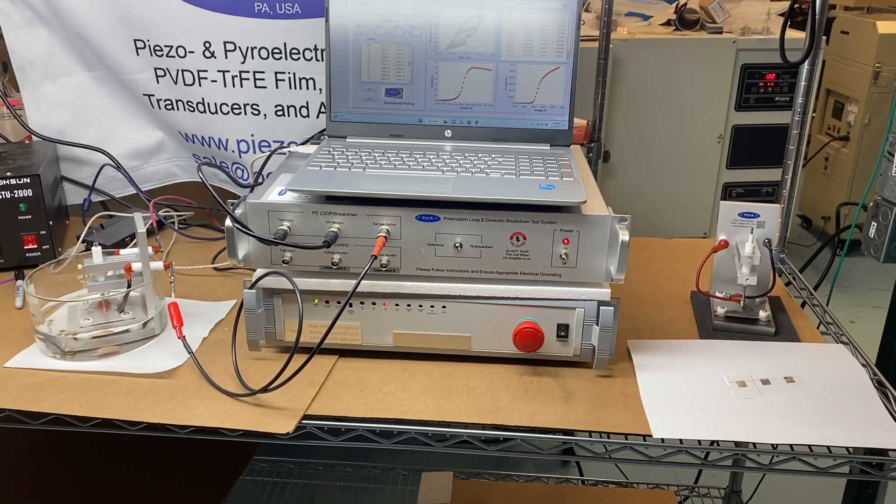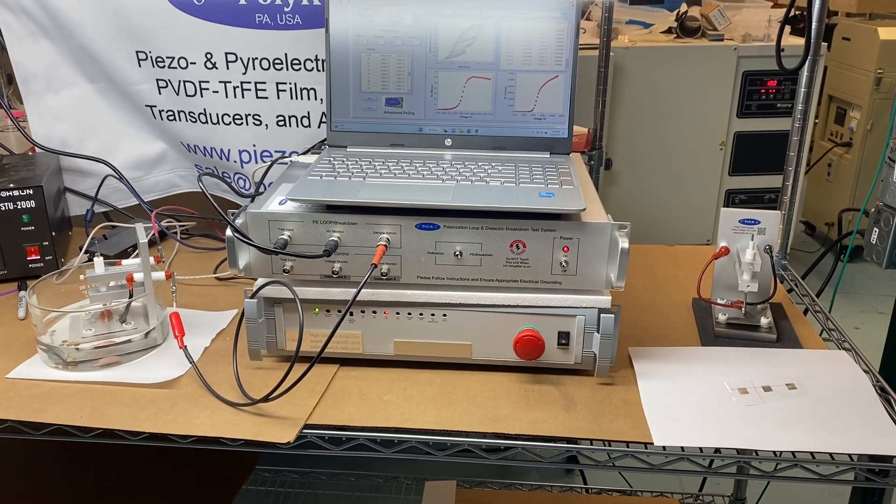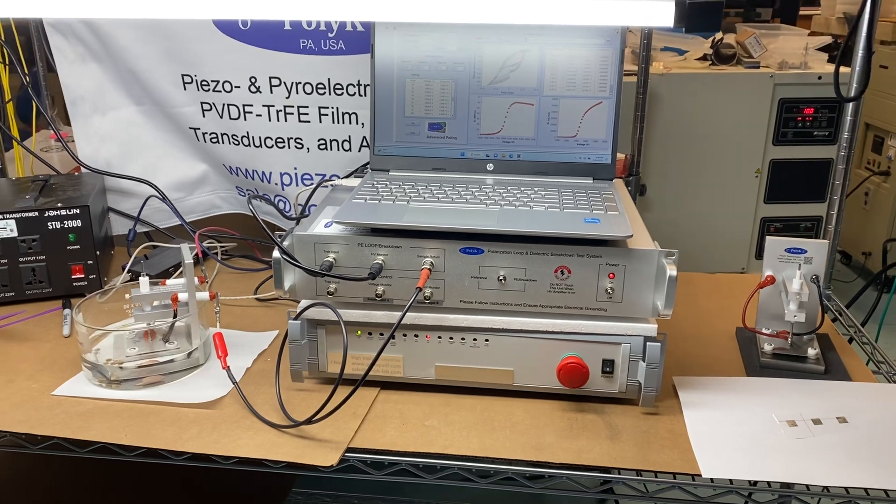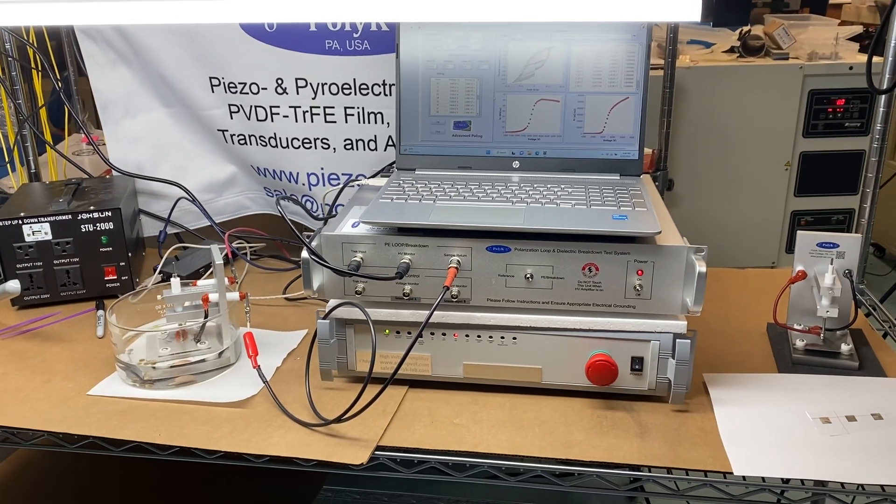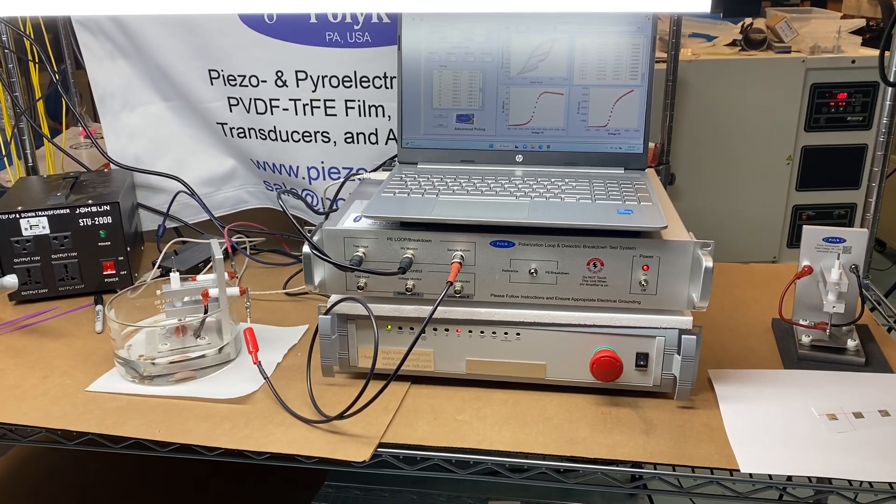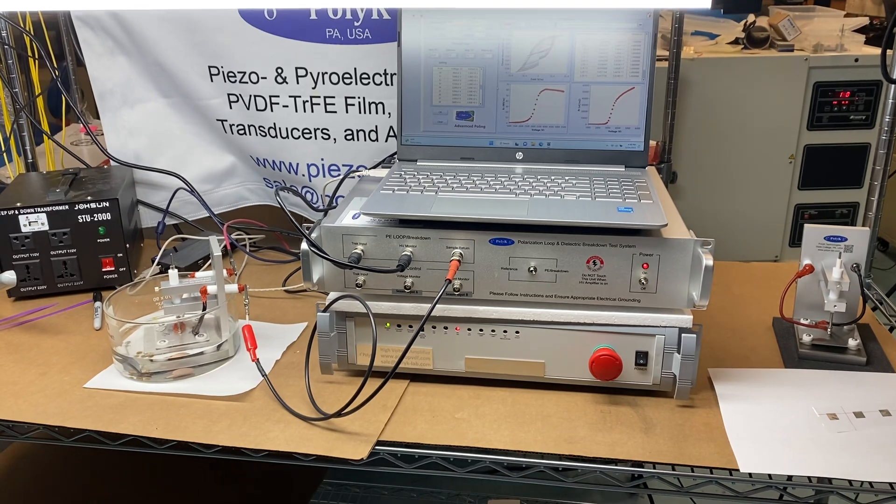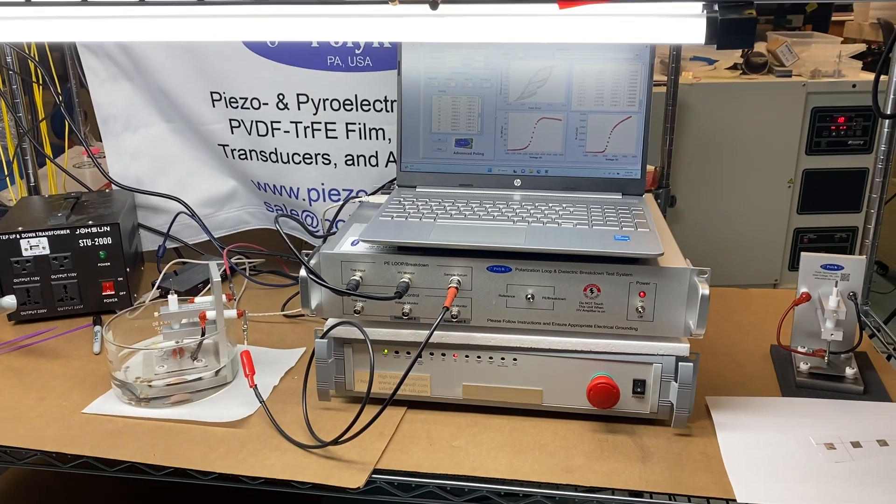This is PolyKey AC pooling system to produce piezo-polymer or piezo-ceramic materials by AC pooling, which is better than a regular DC pooling.